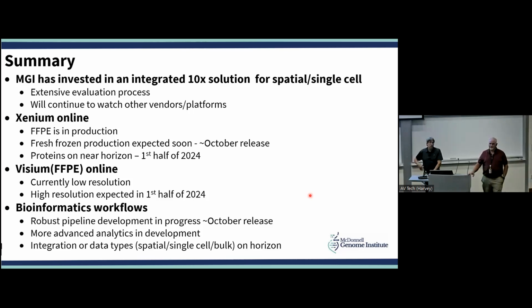Xenium is subcellular, whereas even the Visium HD is about 2 microns. So it's getting you down to cell level. Whether that's subcellular, it's still, I would say, roughly an order of magnitude less resolution.